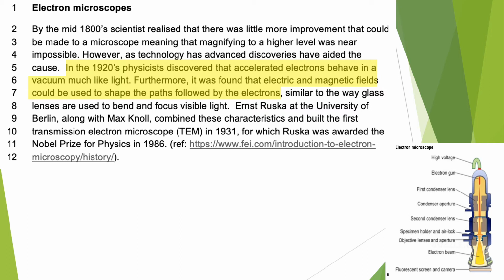And what the electron microscope will do is it will then collect those electrons, and you will be able to see an image on a screen of what you're looking at. So there's no eyepiece lens for an electron microscope, and you have to have it hooked up to a computer and a program that is specifically designed to interpret the collection of electrons.